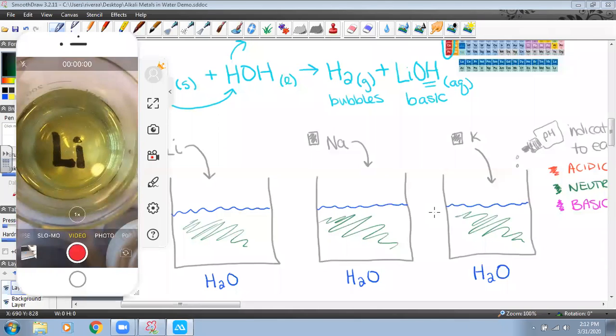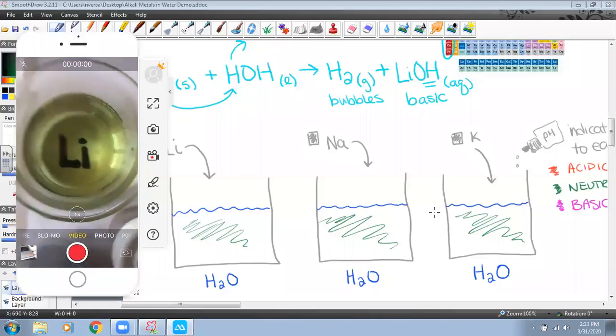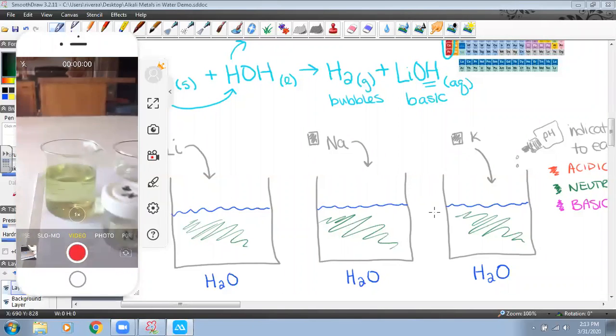I'm going to try with another light. Is that better or worse? Eleanor, what do we think? It's about the same. It looks a little more yellow now. Oh, okay. I'm going to turn the lights off so that we don't have that glare. Okay, so you guys will take my word for it, it's green. Maybe you can tell from here better that it's green.